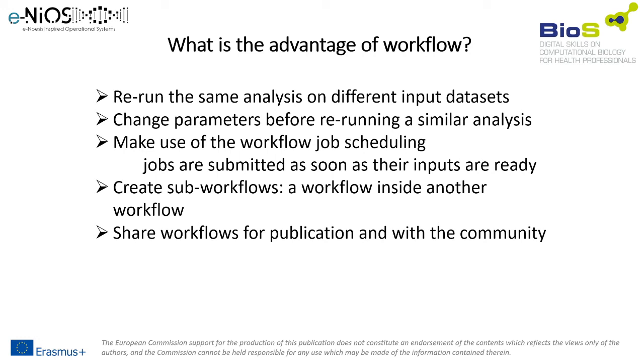You can make use of the workflow job scheduling so jobs are submitted as their inputs are ready, so you do not waste time waiting. It gives you also the possibility to create sub-workflows inside other workflows. And you can also share your workflows either for publication or with your colleagues and with the Galaxy community in general.